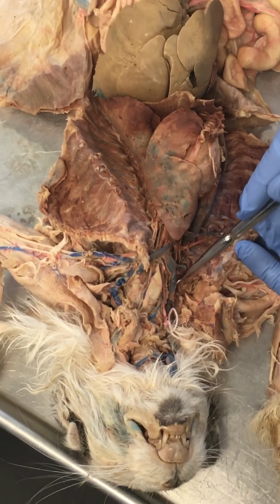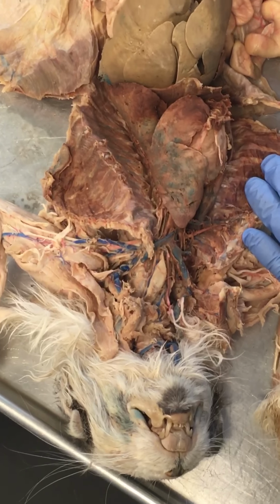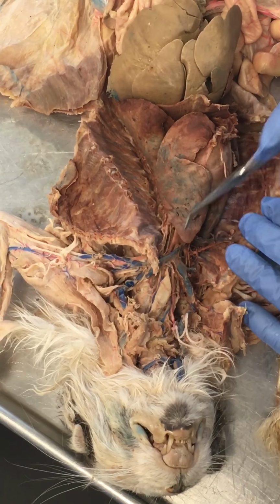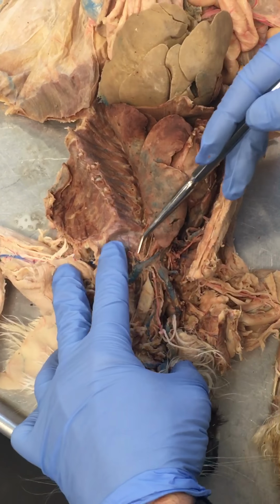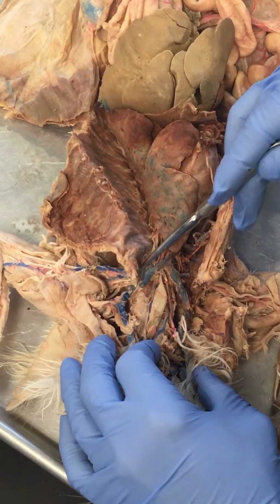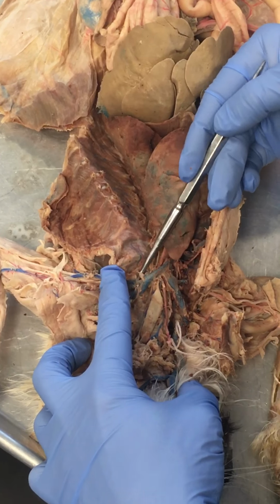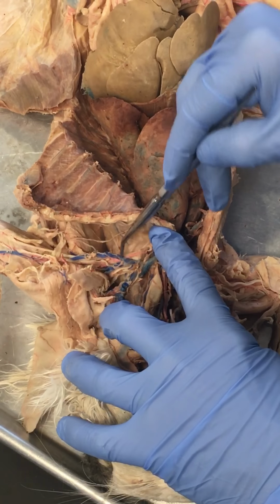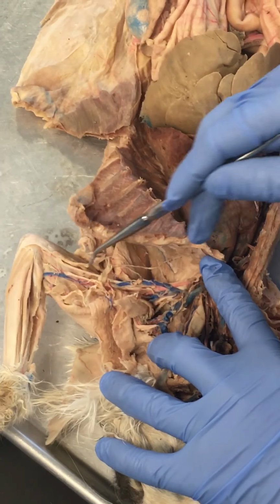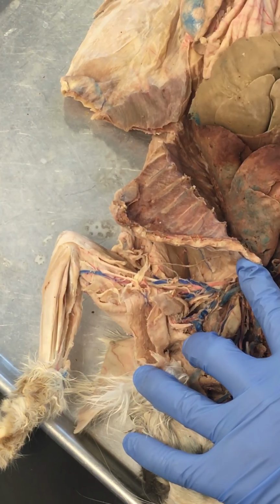External jugulars, okay, this is external jugular going up, and this is external jugular going up on this side. Easy to see. Subclavian veins, so here's what we say. The subclavian veins are relatively short in a cat because we have the brachiocephalic trunk right here, and as soon as we have the branching, here's your external jugular, that vein right there is going to be your subclavian vein, but it's very short because as soon as it goes through the chest wall, now it becomes axillary vein, right? Once we go from the armpit, now it becomes a brachial vein. Then we got radial and ulnar veins as well.